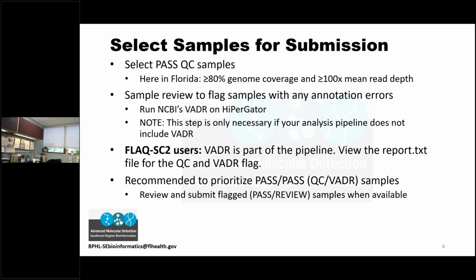And we can also discuss that later if you have further questions about what those new recommendations are. So we batch our samples based on whether they've passed QC or not, and then also based on if they passed Vader. So Vader, I'm going to go into detail in the next couple slides exactly what is Vader, what is it doing.